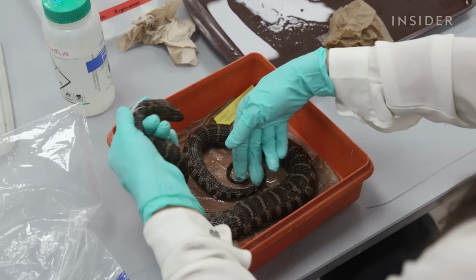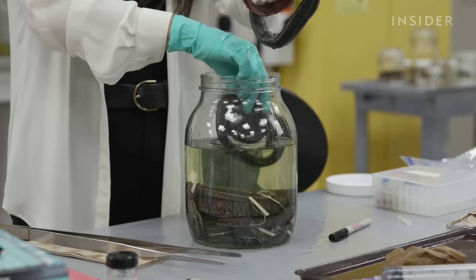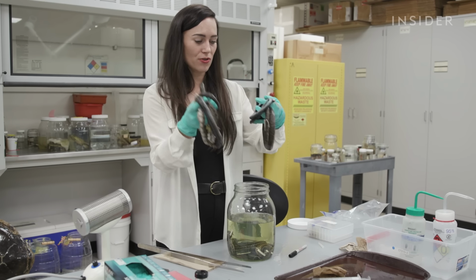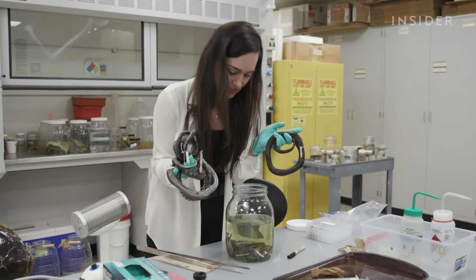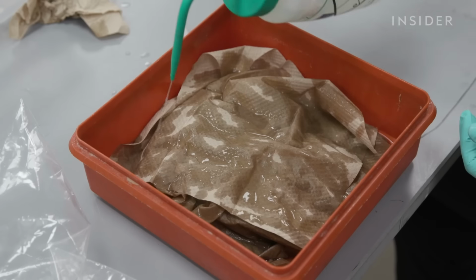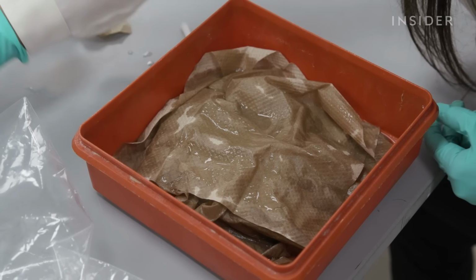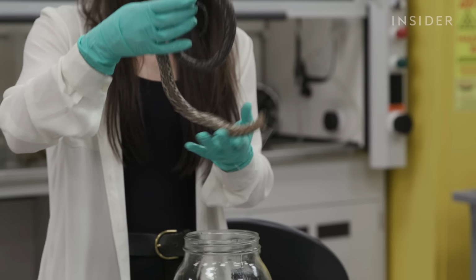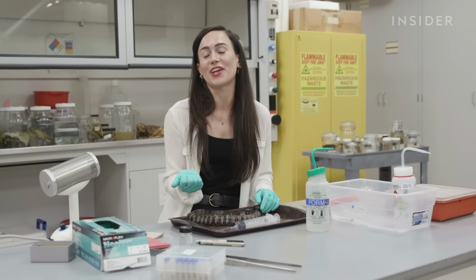The coil doesn't just look snaky. There is some art to it. You can stack lots and lots of them on top of each other in a jar. 1, 2, 3, 4. I've got 5 snakes here, and there's another probably 6 in this jar. Last step in this part of the process is tucking it in under a formalin-soaked paper towel. It keeps the snake saturated without having to fill the tub. Good night, snakey. Over a few days, the formalin will set into the tissue, leaving the snake fixed in place. Almost like you're holding a rubber snake.